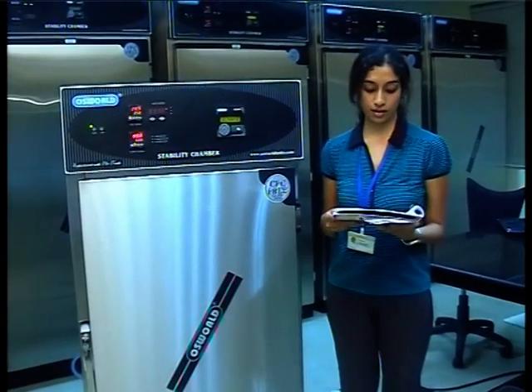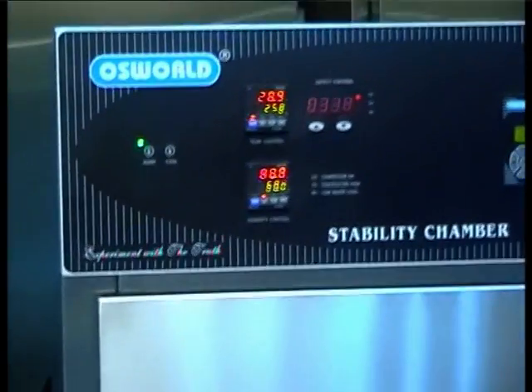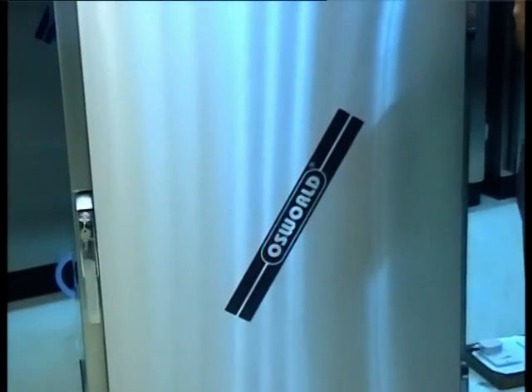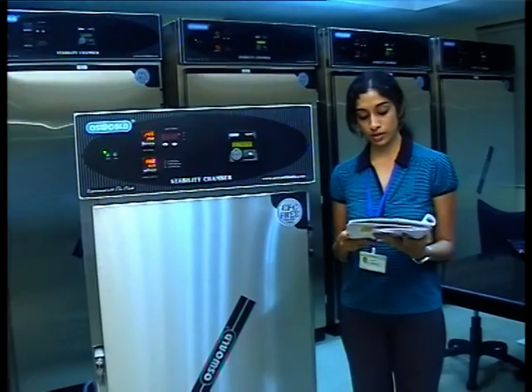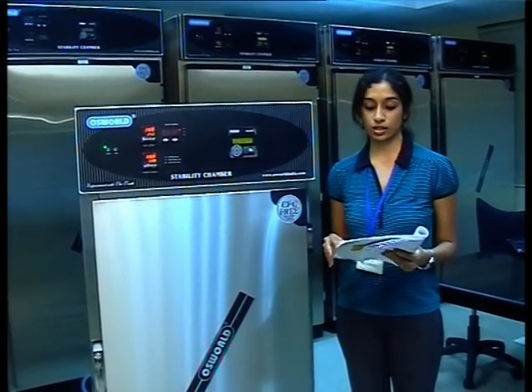Observe that the humidity will rise from its present value to the set value of 60%. On achieving the set temperature and humidity, the equipment should continue to maintain these levels within the specified bandwidth of plus or minus 1 degree Celsius and plus or minus 5% RH. Allow the equipment to run for a period of 3 hours. If this is achieved and maintained, it means that the temperature system and the humidity system are functioning okay.